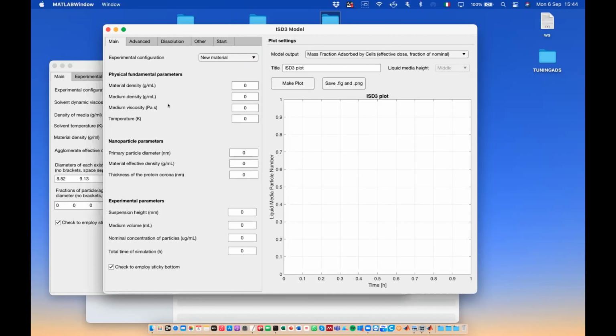And another question that we're often asked is, can DosiGUI be used to model carbon nanotubes? DosiGUI is just a graphical interface which integrates two well-known, well-established models, and of the two, the DG model is the more well-established.